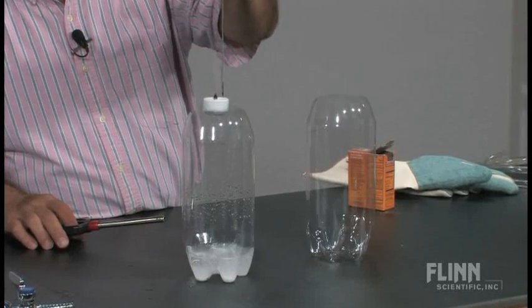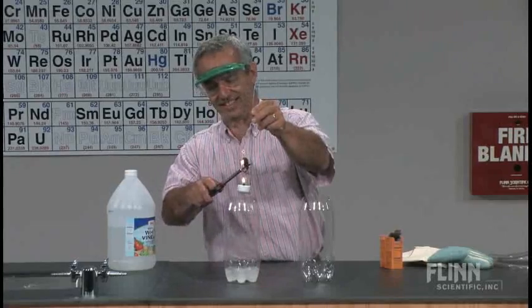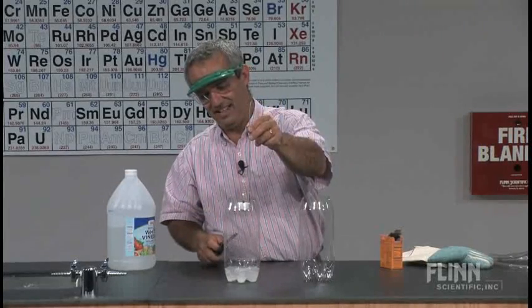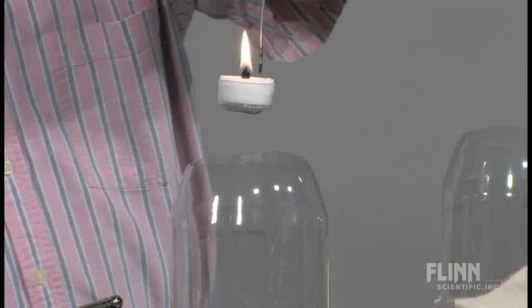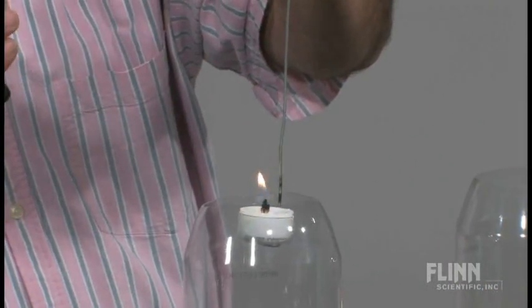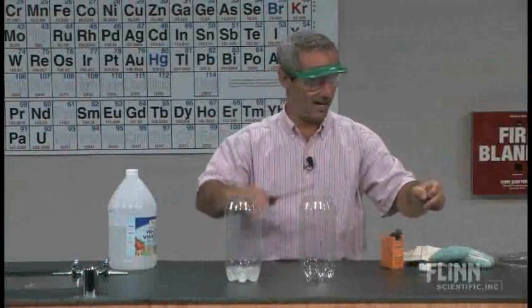Okay every now and then by the way if you get a nice fresh interface it's possible to lift that flame off. There I just did it. There. I don't know if you caught it or not but the flame is actually being lifted off and then it can relight. So it's a nice sharp interface of carbon dioxide and air.